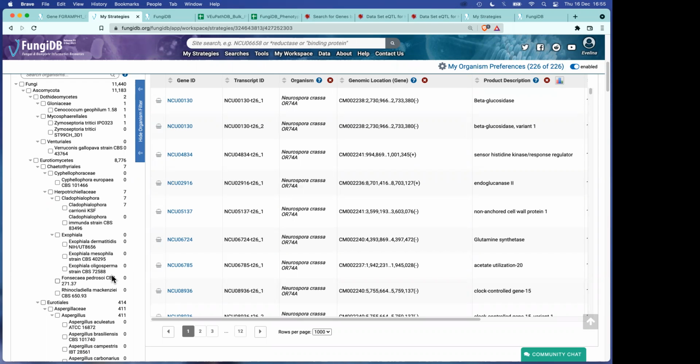And user comments, when entered, can capture text, obviously, but they can also capture images, files, a lot of information that is gathered during research, whether you're doing a PhD thesis or you're a postdoc, that will never actually make it to the publication, because nobody tends to publish the multi-page Excel documents that track phenotypes or other observations that you have made.